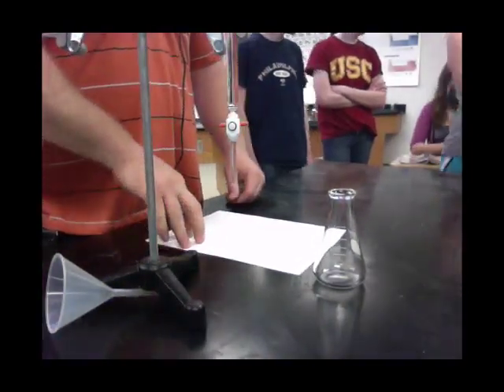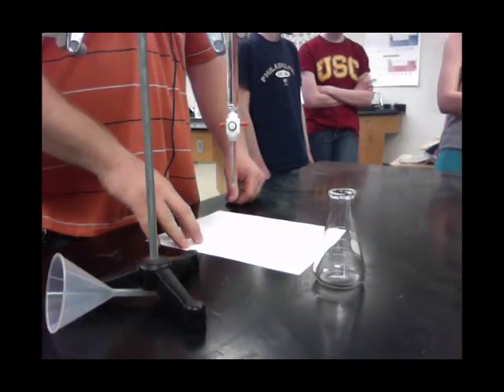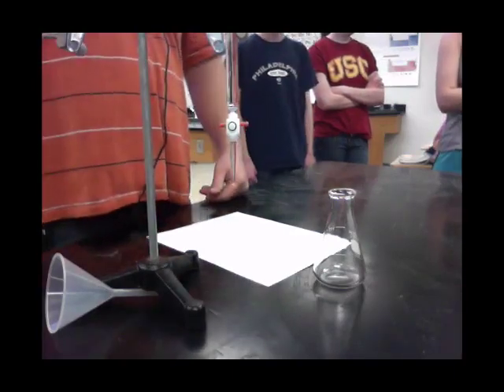Can someone write that down for us? 3.85 milliliters. So 3.85 milliliters was my starting value. And now I need to put my titrant in here — or my unknown.